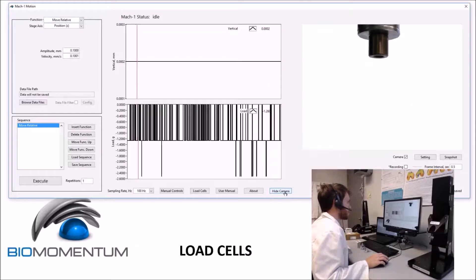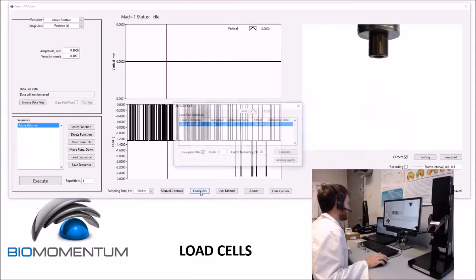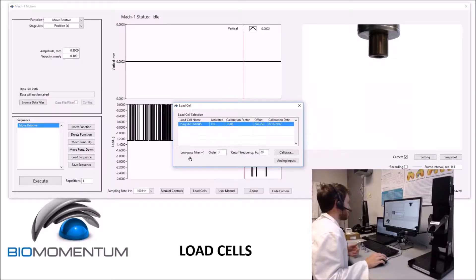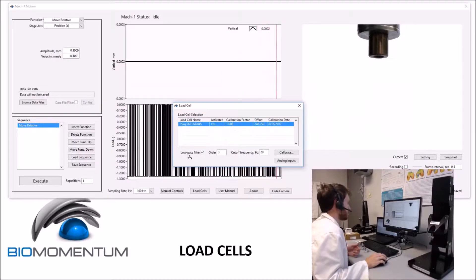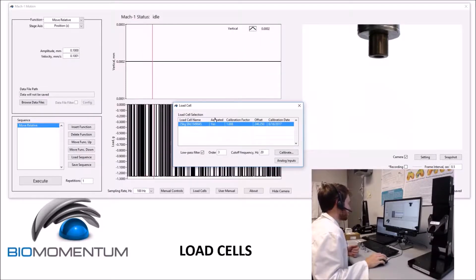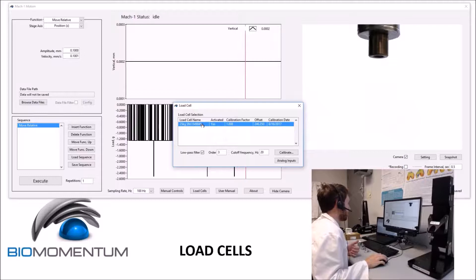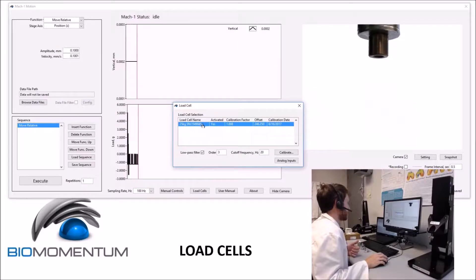We'll use the camera to clarify this next part. Clicking the load cell button will open a window that allows the selection and calibration of a load cell, as well as the selection of a low-pass filter to reduce the noise in the load signal. All the available load cells will be listed, and the activated column will indicate which load cell is activated. Double clicking any load cell will activate it, and only one can be activated at a time.